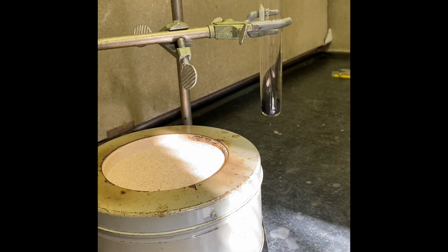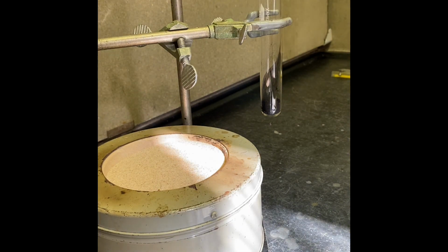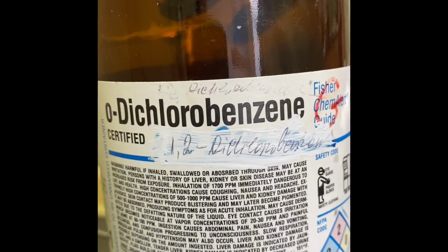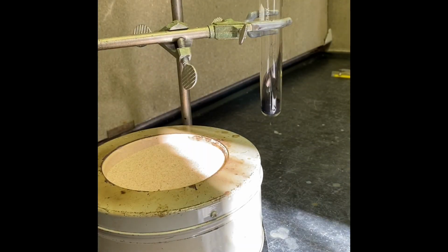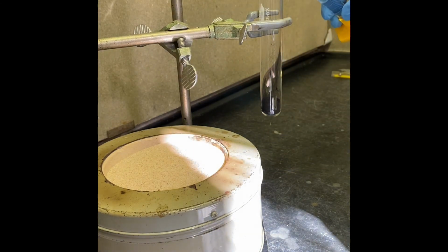So for reaction as a solvent, we're gonna use ortho-dichlorobenzene. 10 milliliter of that solvent we're gonna use. So I'm gonna get 10 milliliter ortho-dichlorobenzene and 10 milliliter of that solvent.